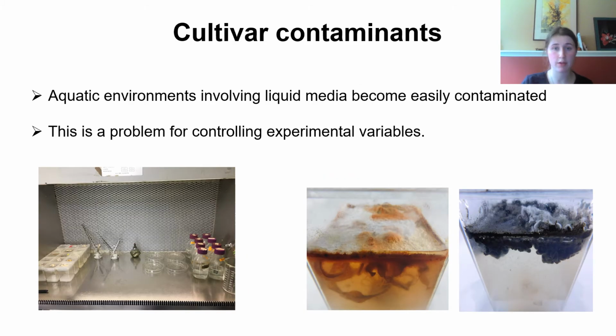Despite use of a laminar flow hood to maintain sterility, the sterile conditions in the lace plant's aquatic environment are easily compromised, as it is optimal for both the growth of plants and unwanted microorganisms. Contaminated cultivars result in economic loss for the lab and underscore the need for a simplistic procedure that eliminates contamination in our lace plant cultivars.